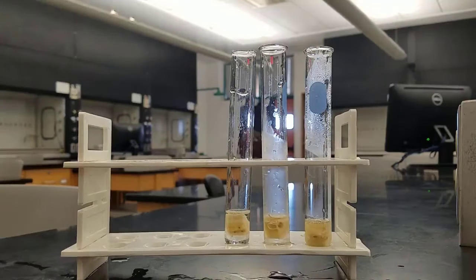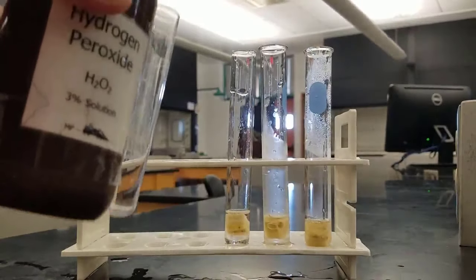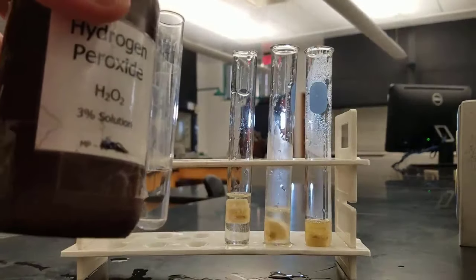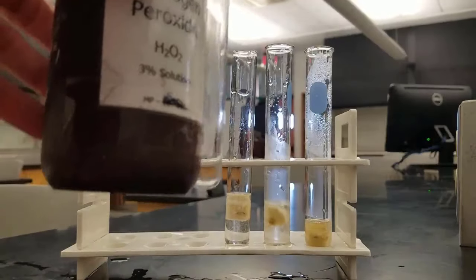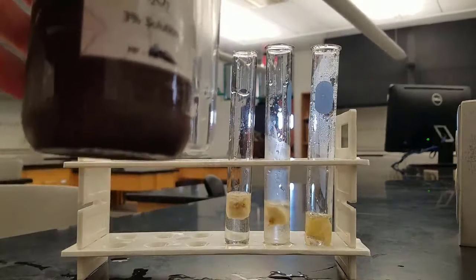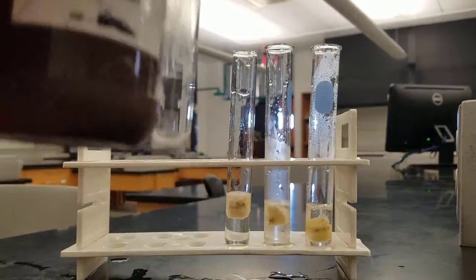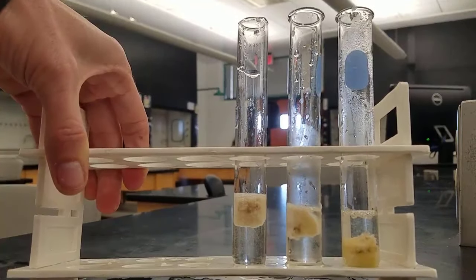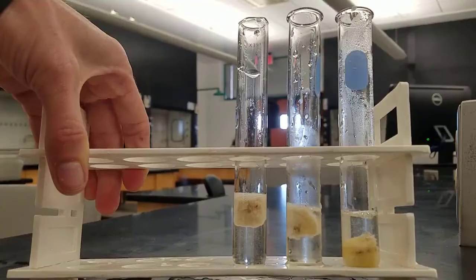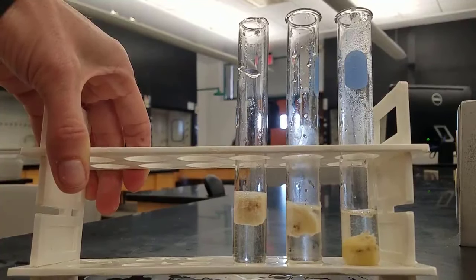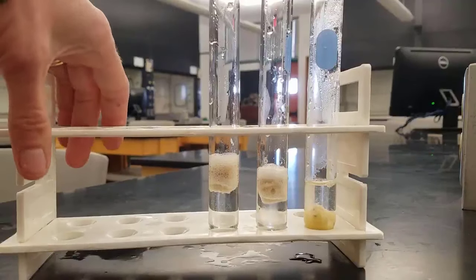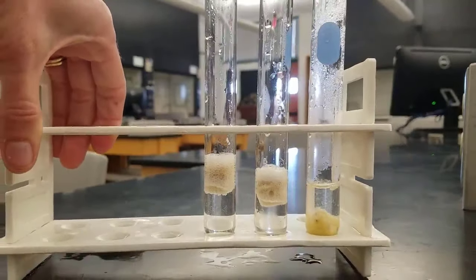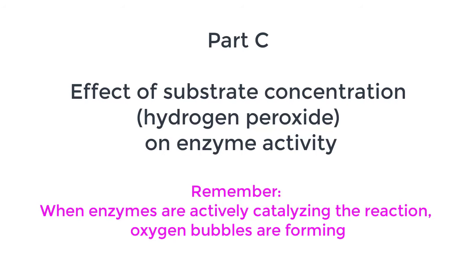Remember, there's no substrate yet — no peroxide — so there hasn't been any bubbling or reactions. Now we're going to add that hydrogen peroxide, about the same amount to each test tube. Bubbles indicate that we have a reaction forming and that our enzyme is active, so look out for those bubbles. After a few minutes you can see room temperature, cold, and hot. Normally heat speeds up reactions, so you'll want to think about why that last one didn't speed up.